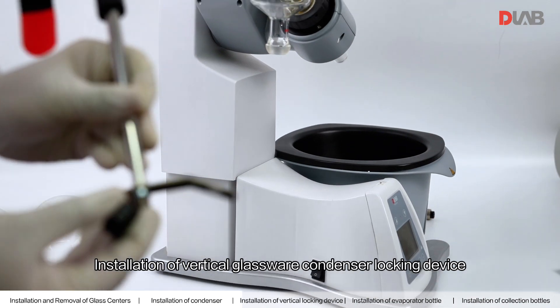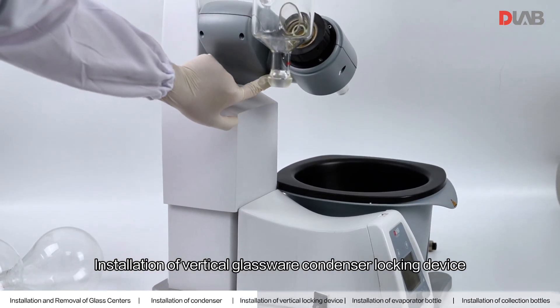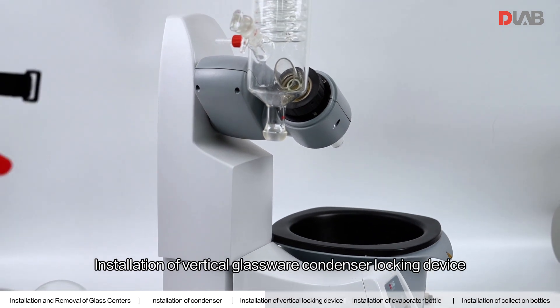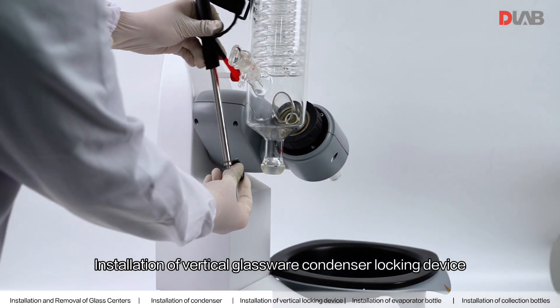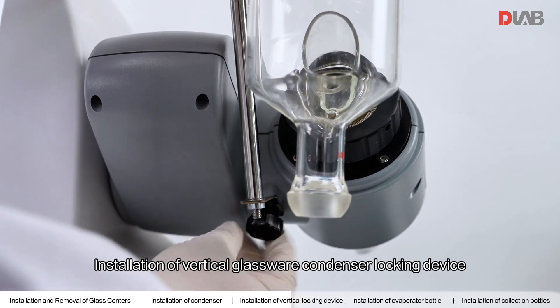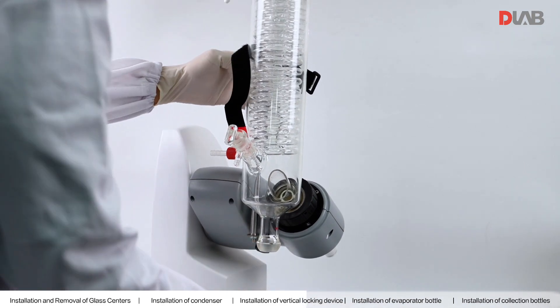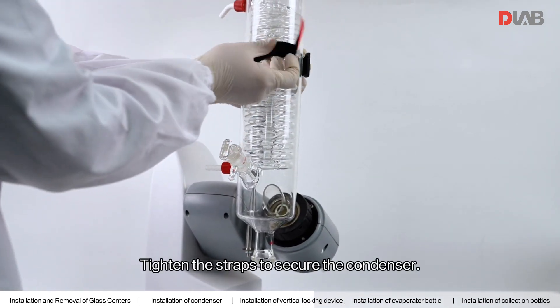Install the vertical glassware condenser locking device. Tighten the strap to secure the condenser.